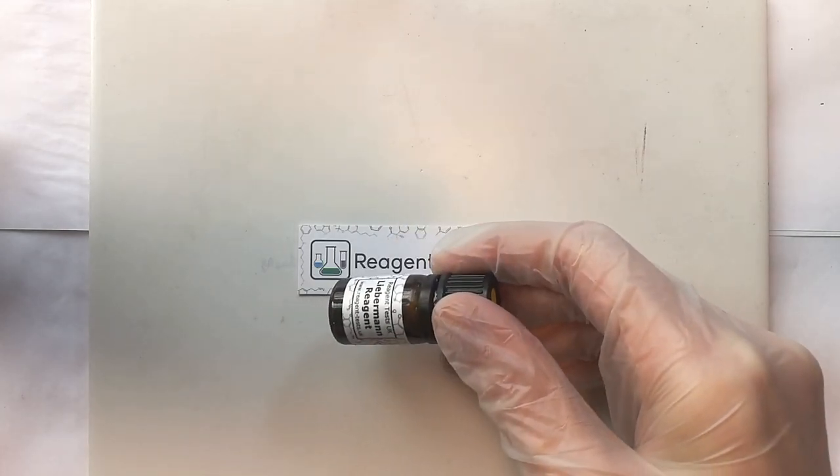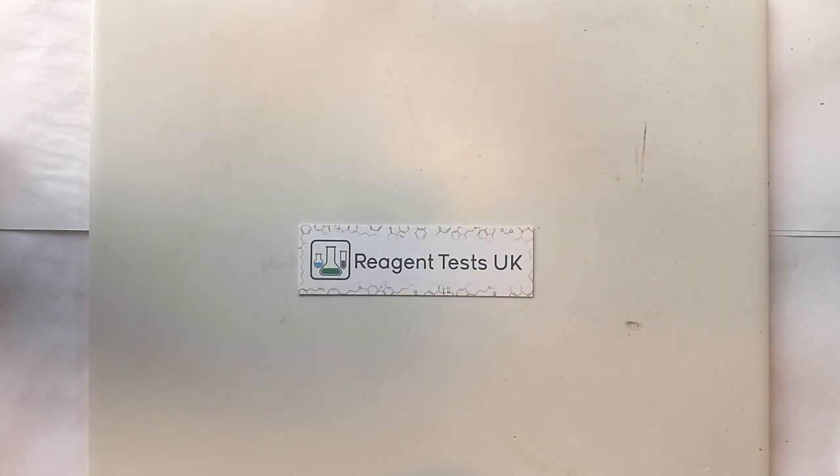My name's Guy Jones and I'm going to show you today how to use Reagent Tests UK's Solid Reagent Tests. Reagent tests are legal chemicals that are used for testing of drugs and chemical substances. They're really quite easy to use and once you've done it once or twice it's something you can do within a few minutes.